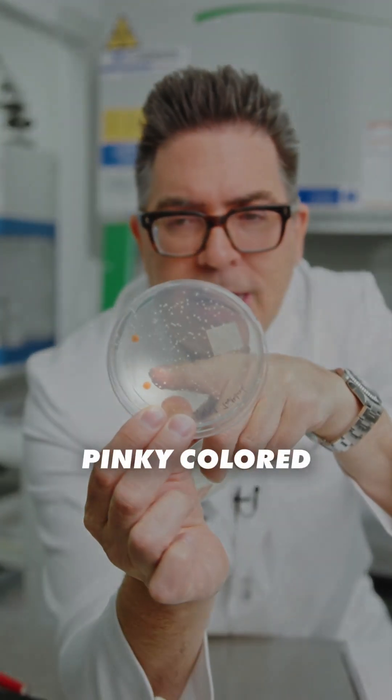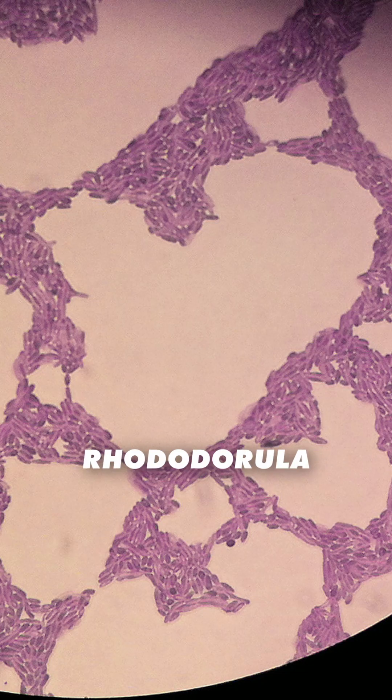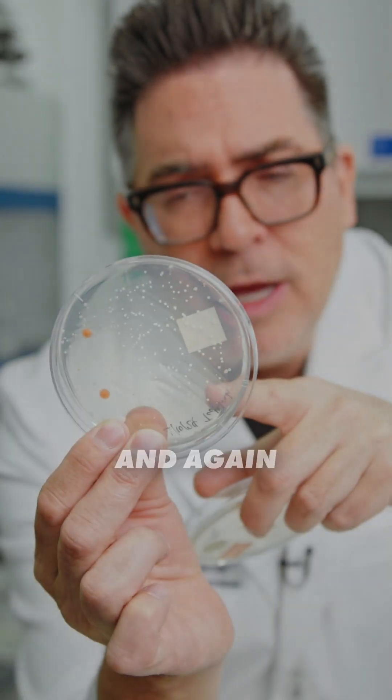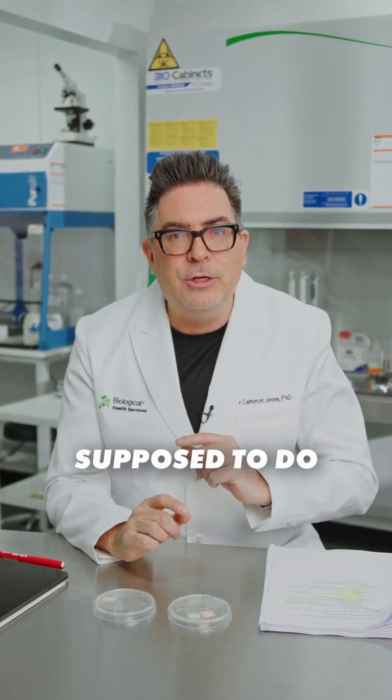Now see this pinky colored yeast — this is a really common yeast called Rhodotorula. And again, we've got a whole lot of bacteria here. I suspect that these are E. coli and Staphylococcus. I was even able to recover some fungi.